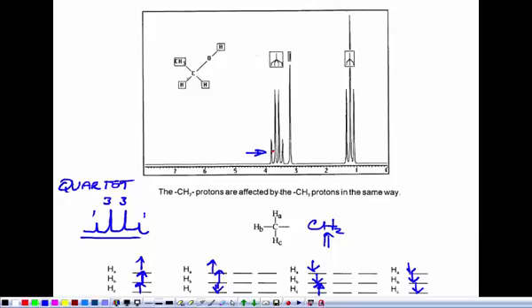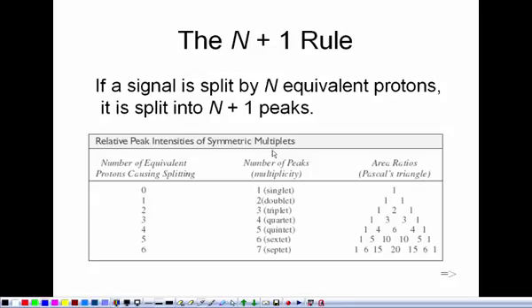All right, everybody okay up to this point? So we saw a CH2 group split protons into a triplet, a CH3 group split the protons into a quartet. So what's the rule then that we can use to predict the patterns and how many peaks we would see? Well, the rule is n+1. In other words, the splitting pattern of a nucleus is given by n+1, where n is the number of adjacent neighbor protons. So in other words, the hydrogens that are attached to the carbon that are next door. And the caveat is that we only count neighbors that are attached to carbon atoms. Those are the only neighboring hydrogens we're going to have.